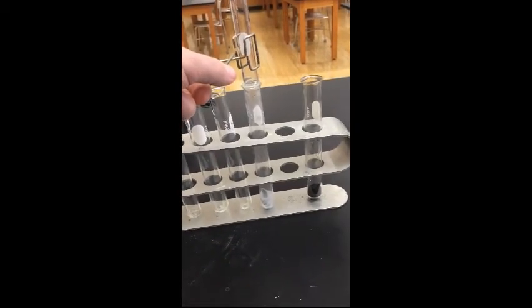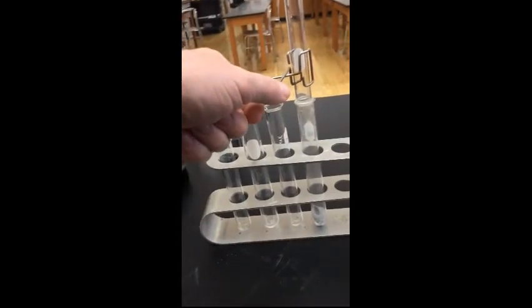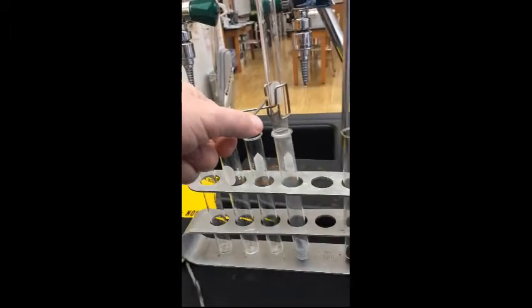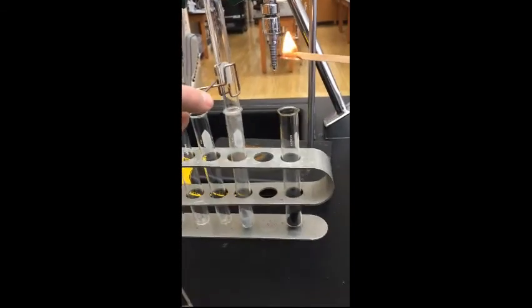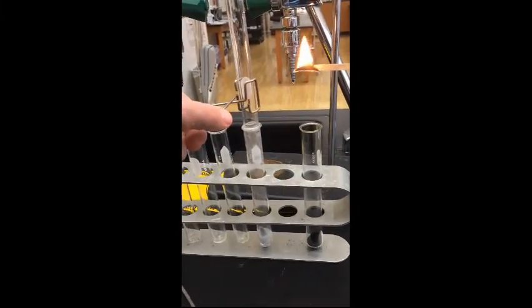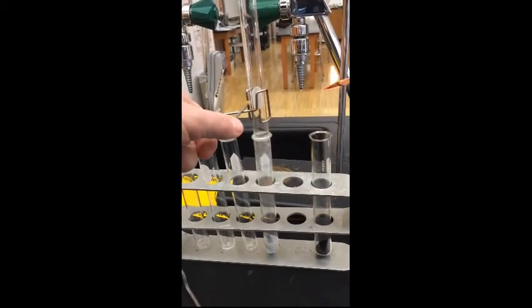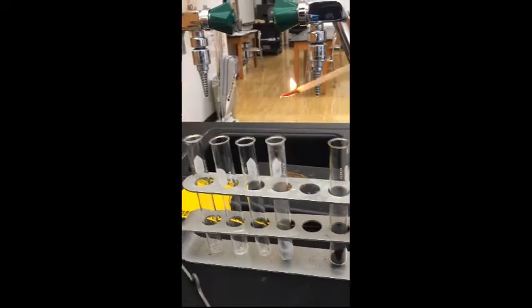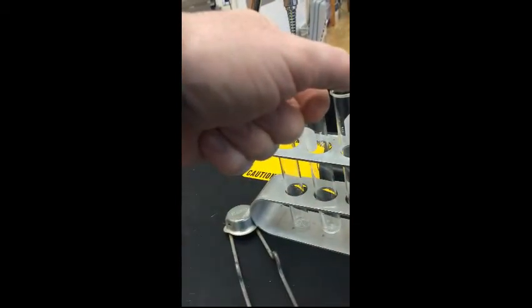I'm going to get my wood splint ready. And I'm going to light it. And we slide this over a little bit. I've got my wood splint ready, and basically I'm capturing the gas that's coming off there. Alright, so ready? It was a little anticlimactic. Usually it makes a little bit more of a higher pitched sound. Let's try it again.